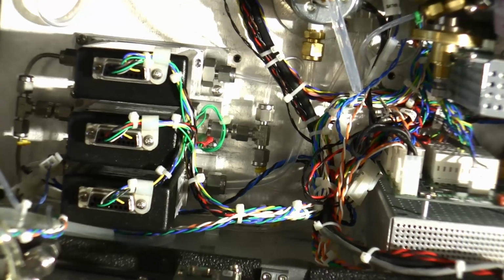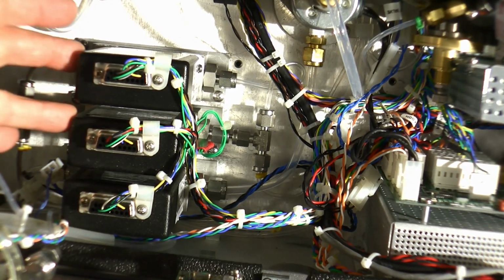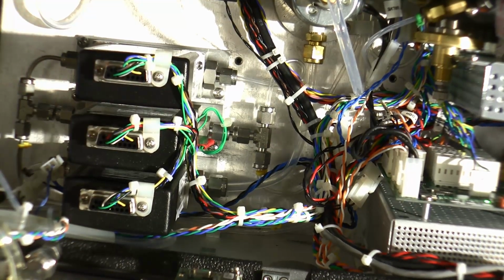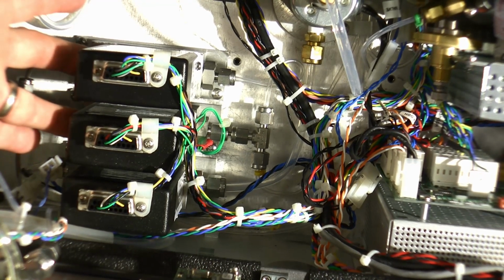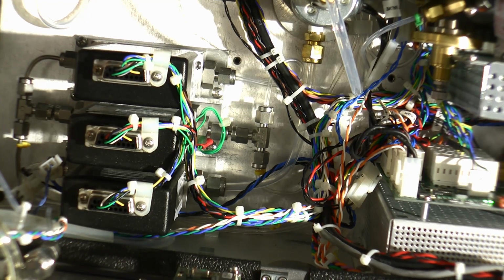So you can see down there, since the gas going through the gas MFCs is the same, there's a T on the input and a T on the output. So this single gas port comes in and feeds both of these gas mass flow controllers, and then they blend back together on the outside, or output.